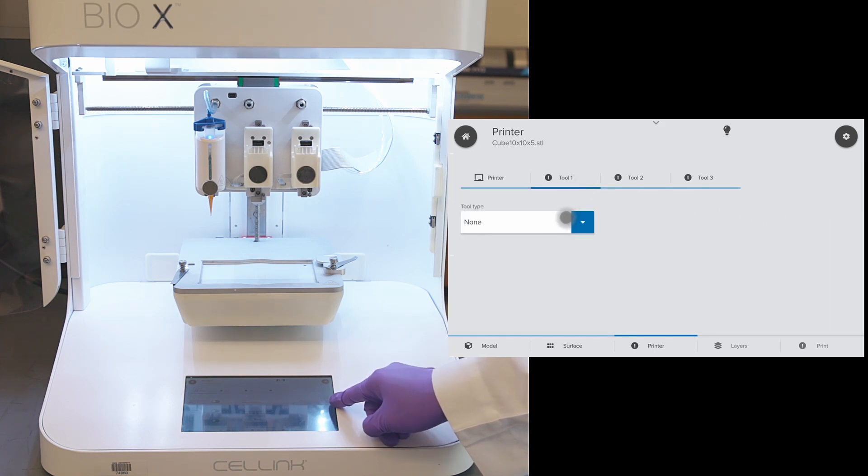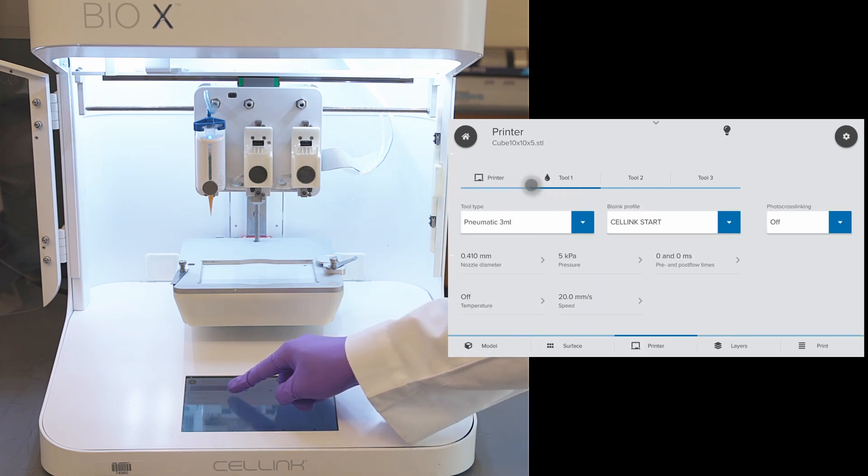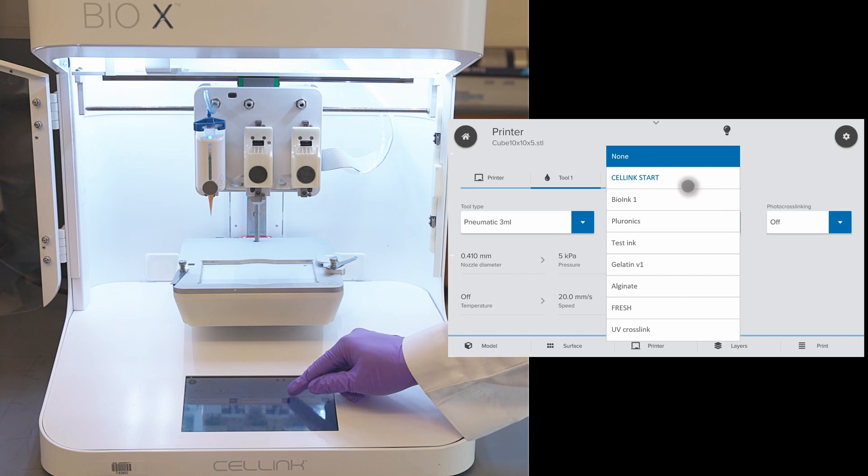Next, we click on tool 1. Click on tool type and automatically the type of printhead will be highlighted. Here, it is a pneumatic 3 milliliter printhead. Next, we have the bio-ink profile, which is Cellink Start material, or we can choose from one of these materials. Or, create a new profile so that we don't have to enter these printing parameters every time.